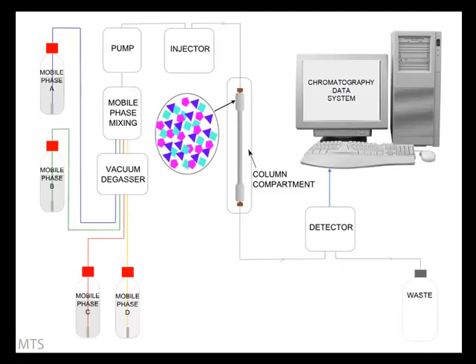in the mixture. In our mixture, the pink component spends more time in the mobile phase relative to the green and the blue, and travels through the column quickest. The blue component, however, spends more time on the stationary phase relative to the other 2, and travels through the column slowest. As the mixture passes through the column, they become more and more separated.